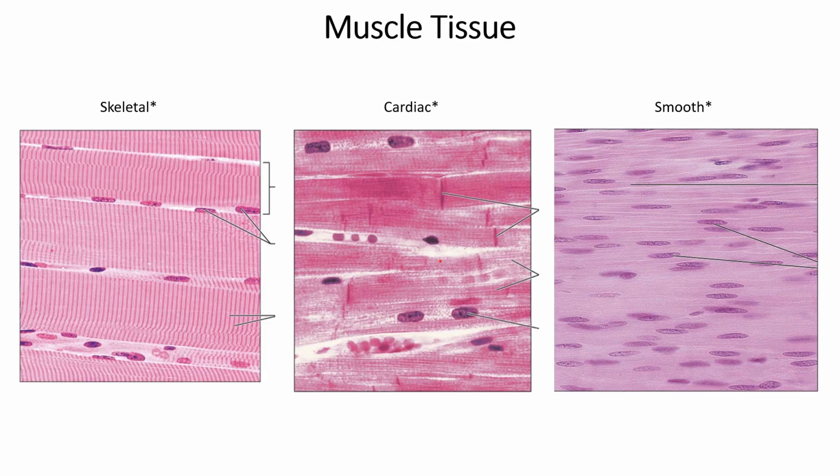So this entire structure would be a cell, this would be a cell, etc. For each of those cells, you have those alternating patterns of light pink, dark pink. Those are your striations. So skeletal muscle and cardiac muscle will both have striations, right? Cardiac muscle here is maybe not as well defined, but you can still make out a pattern of dark and pink striations.